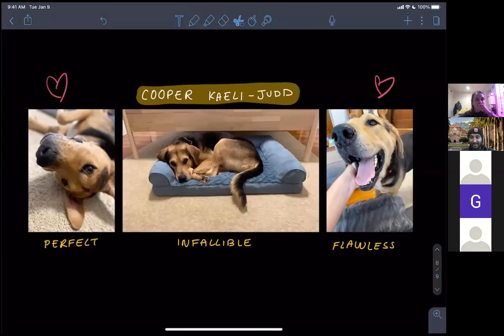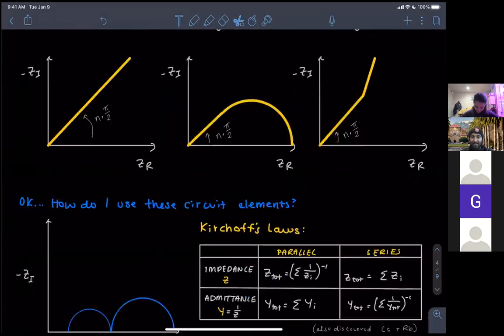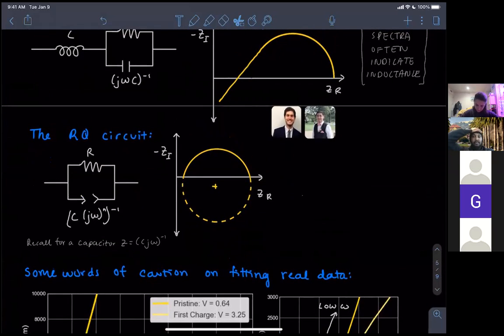No, just for providing some insight into the constant phase element. I agree, the constant phase element right now is commonly abused. Let's just say it's used to fit whatever is not a perfect semicircle, but rather a depressed one. But its original derivation comes from an inhomogeneous surface, say there's a distribution of RC circuits. It could be a distribution of resistance or of capacitance. Basically, if the surface is not exactly the same, you will have a small distribution that's spread out, and that will cause your RC circuit to have a distribution of time constants, a distributed semicircle. When you overlap those semicircles together, the depressed semicircle comes from the overlap of the distribution of RC circuits.